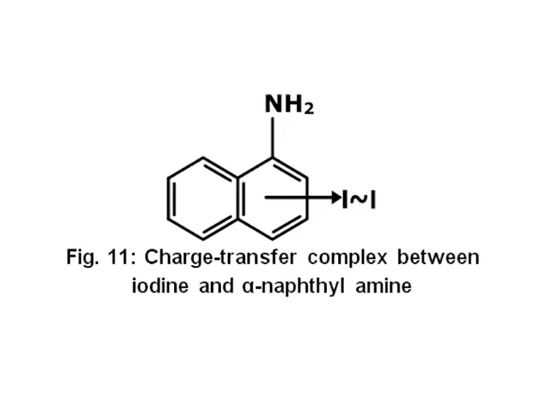Sublimable or low boiling organic reagents may also be made to interact with and fix iodine absorbed on the latent fingerprints, used in vapor state. For example, iodine interacts with alpha-naphthylamine to form a red colored charge transfer complex. Although free iodine does not possess a natural dipole moment, yet in concert with an aromatic system, it acquires an induced dipole.